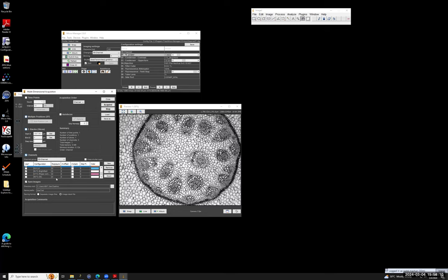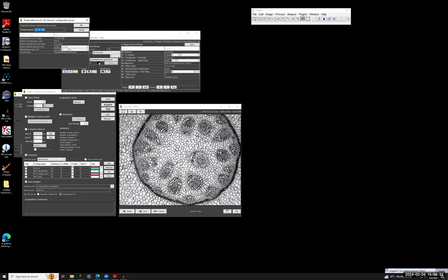than for bright field. But of course, each channel contains more settings than just the filter cube. So if I want to edit the settings for each channel, I can go to the respective channel and press edit. That will show me all the settings that apply to this channel. So you can see for each channel I can set the filter cube. I can set the fluorescence illumination attenuator. For each channel, I can set the condenser contrast, because the channels are both for fluorescence as well as for transmitted light. So I need to have here all the controls that are relevant for setting the channels.